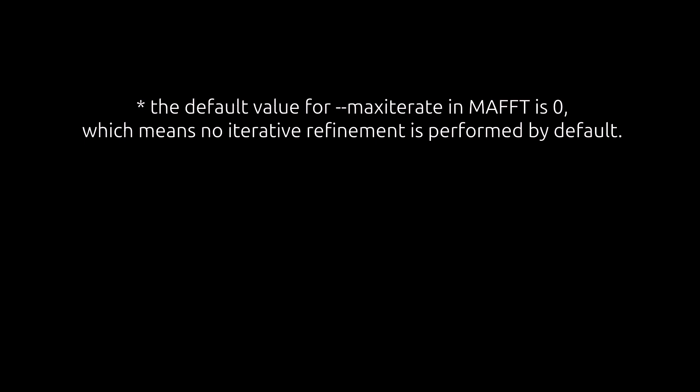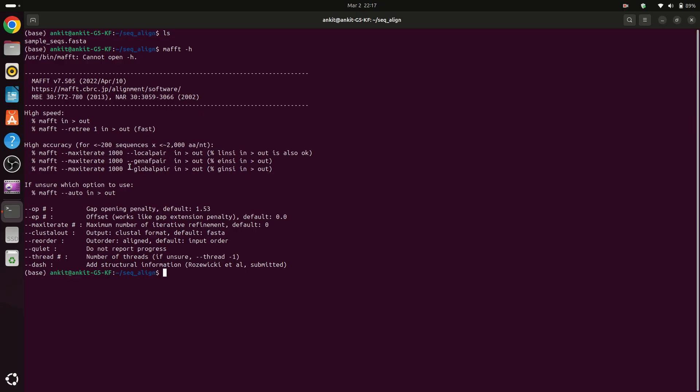So what are the important options here? First see that we have maxiterate for maximum number of iterative refinements. It means that MAFFT will align your sequences multiple times and then it will store the consensus sequences.